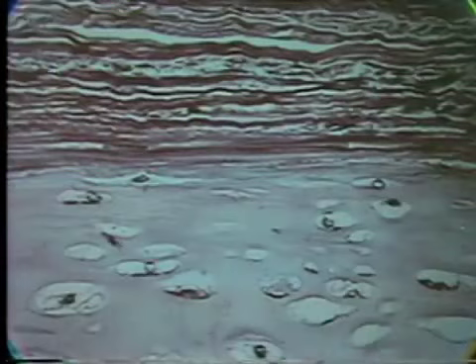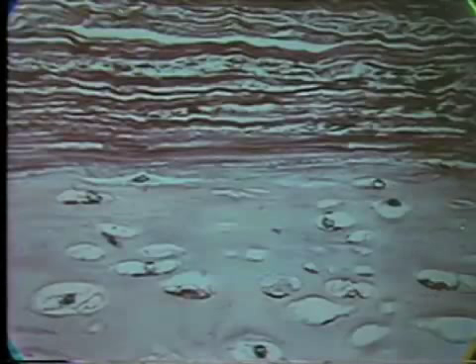Please answer the next 5 questions. These will be slides, and we'll give you half a minute on each slide. Name the tissue found in the top half of this slide.